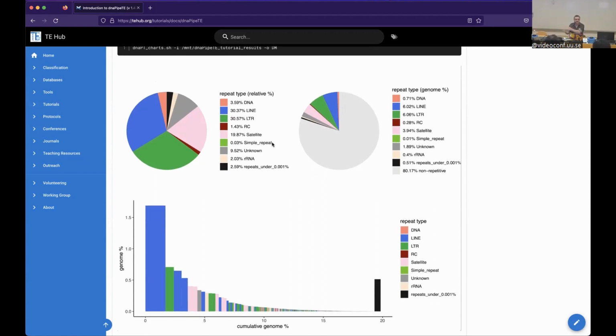If you bring it back to your laptop with a screen later, outside of your cluster or wherever you use it, it can actually run on a laptop with 8 cores and 10 gigs of RAM. Here we have Drosophila melanogaster.